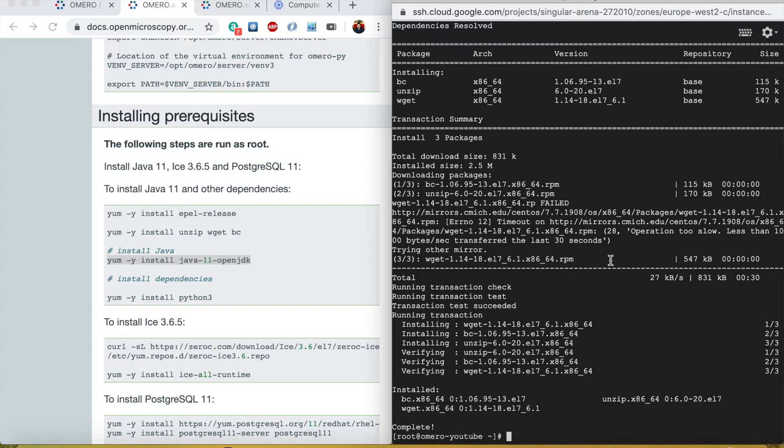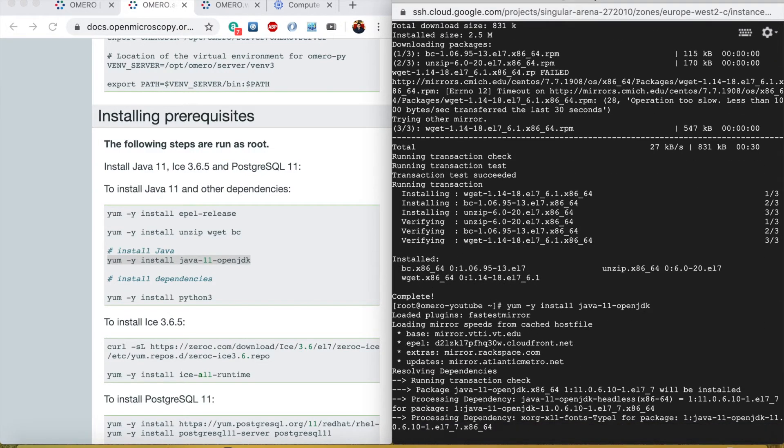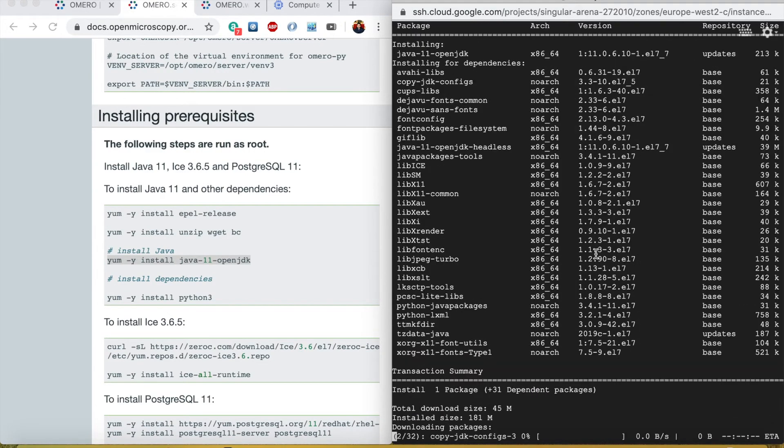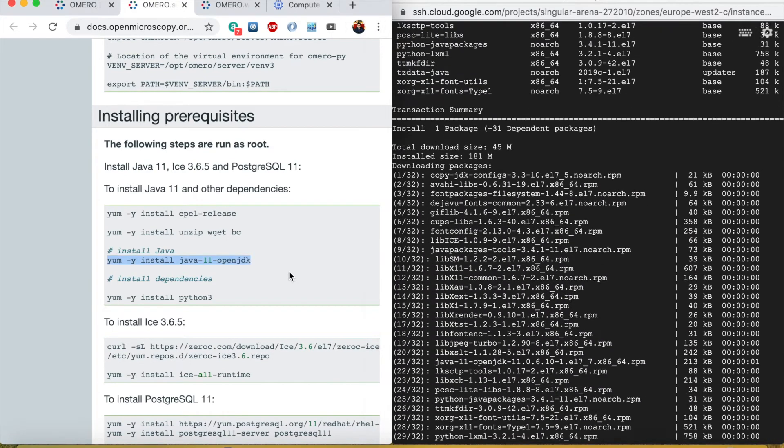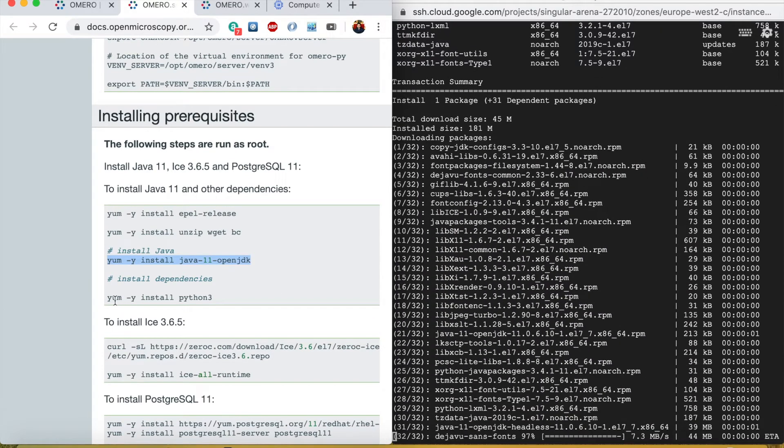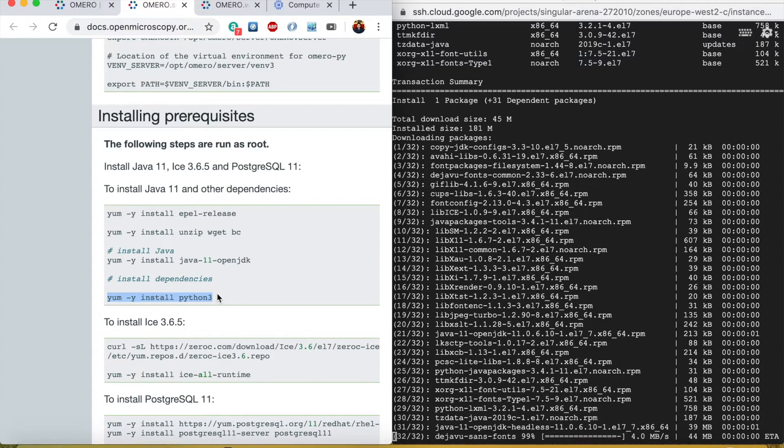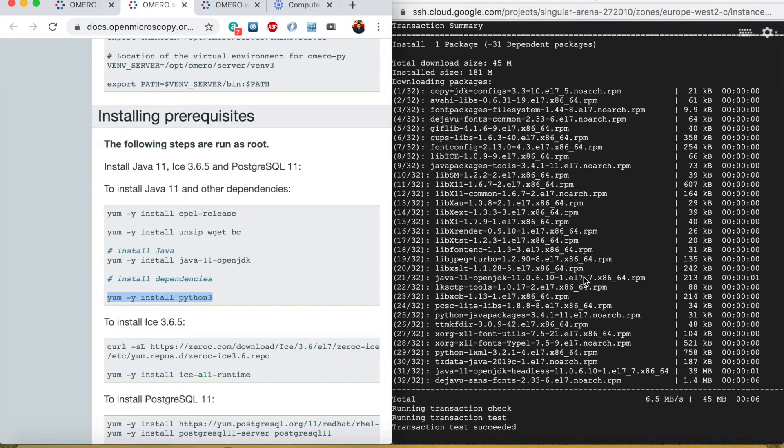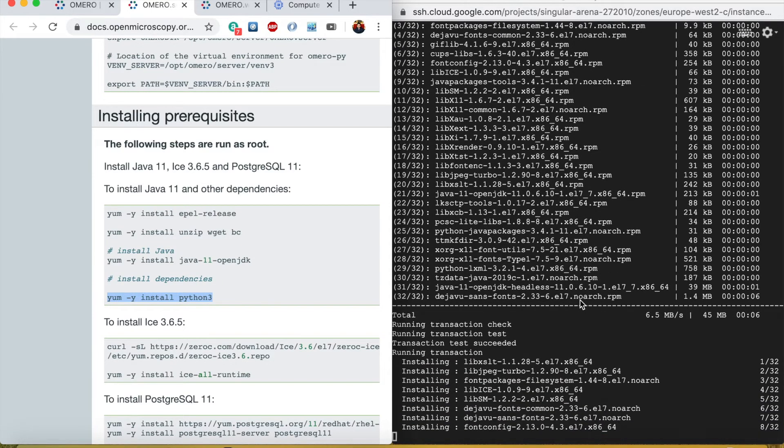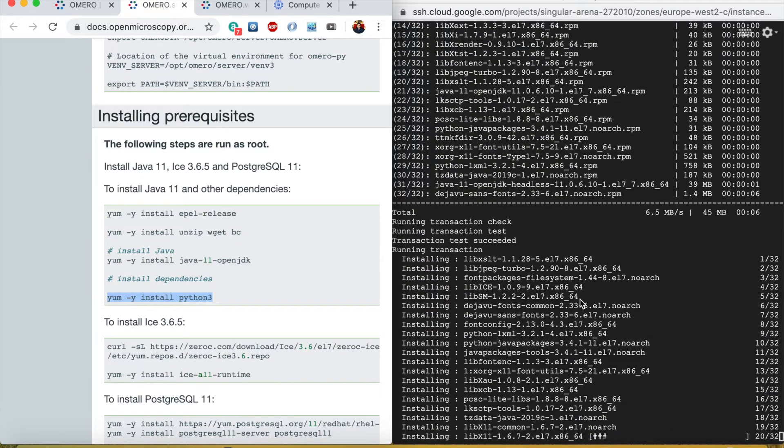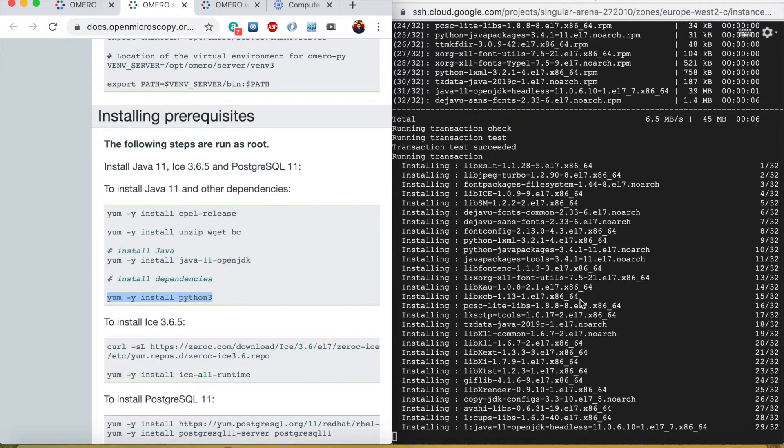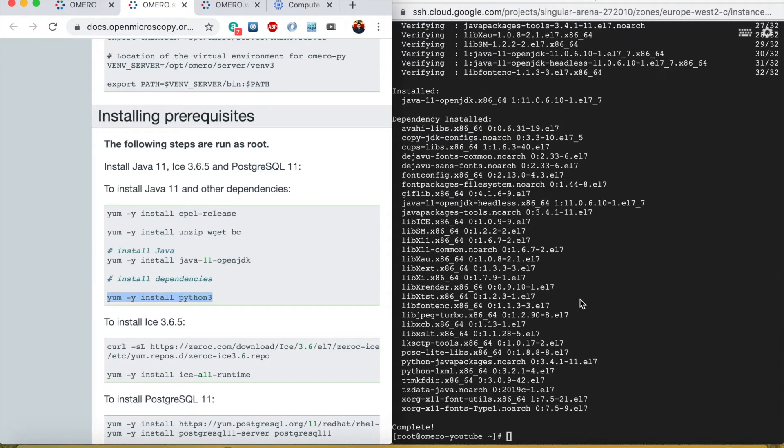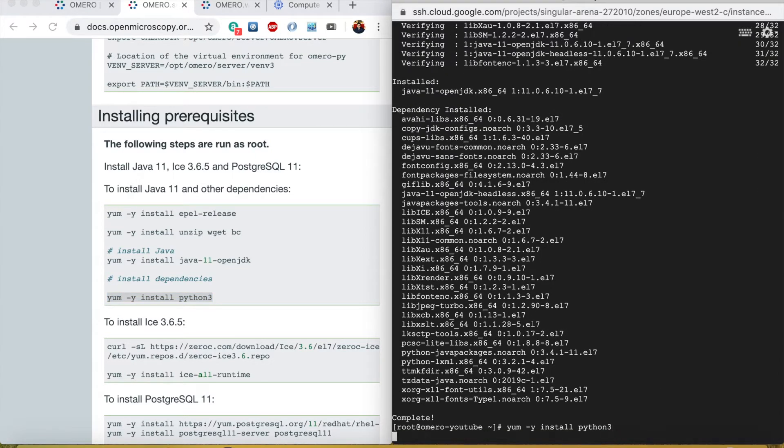When this is done then I will install these other tools: zip, wget, and bc. Now I will install Java 11 OpenJDK and after that I will install Python 3.